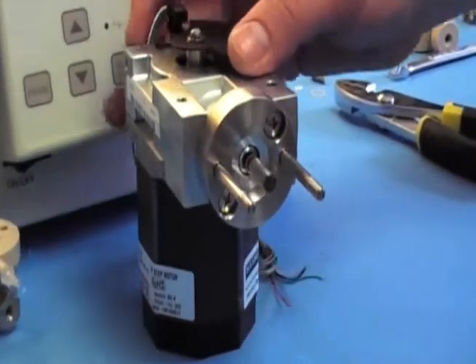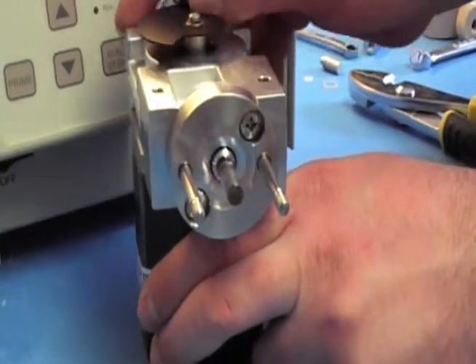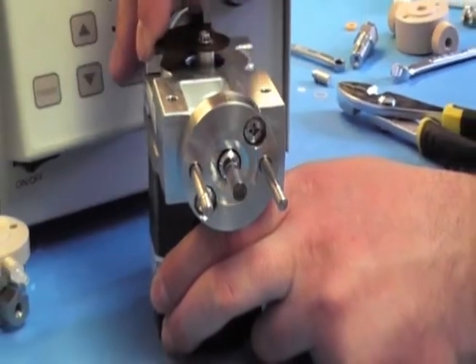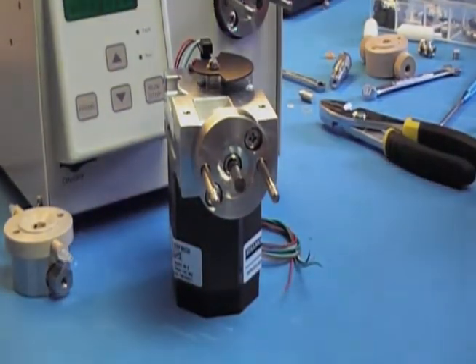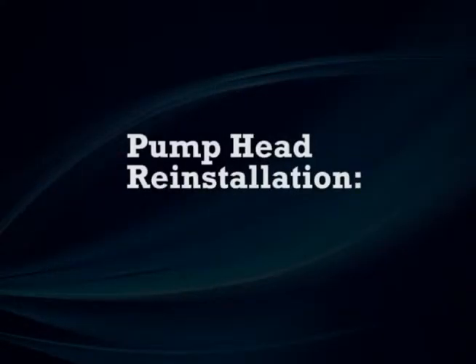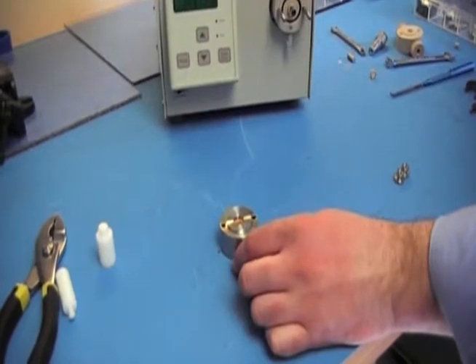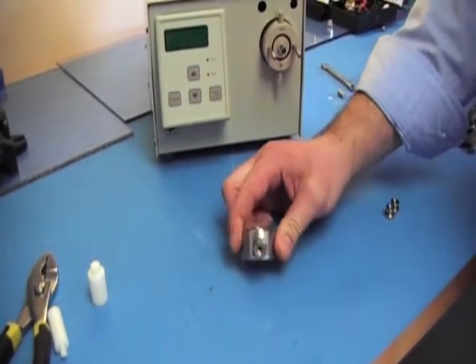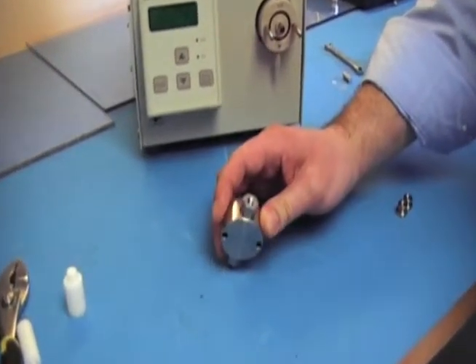The piston is replaced. Make sure nothing bound up and everything went in correctly. Spin around the flag, make sure it pumps smoothly, and make sure it does the refill stroke on its own. You're ready to put the head back on. First check the orientation — make sure you have it all in the right direction with the proper flow path.